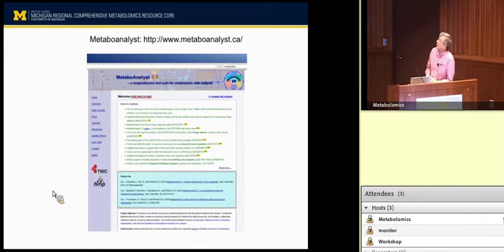It has a lot of embedded statistical data organizing, statistical management, and visualization tools, and it gives you a nice first level. It even has some pathway mapping now. They keep adding to it. This is a really good group, and they've done a good job, so I would explore it a little bit. I'm going to show you a little bit of data we dragged out of that, but mostly I'll show you it a different way.